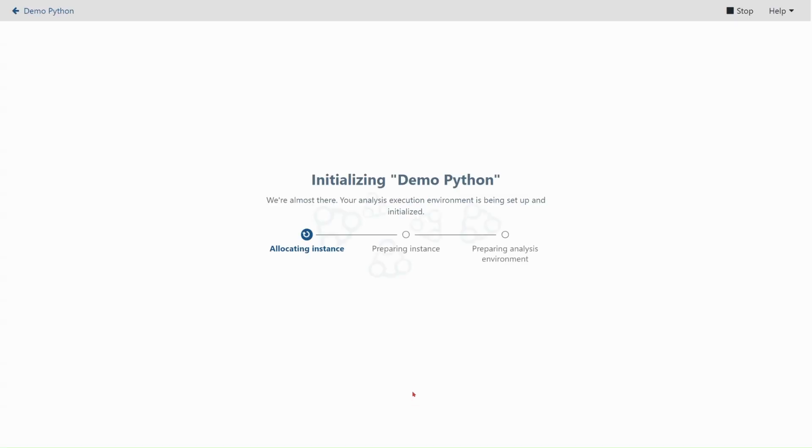After clicking start, the environment needs time to initialize. This can sometimes take three minutes. So we will use the magic of video editing to speed through this.